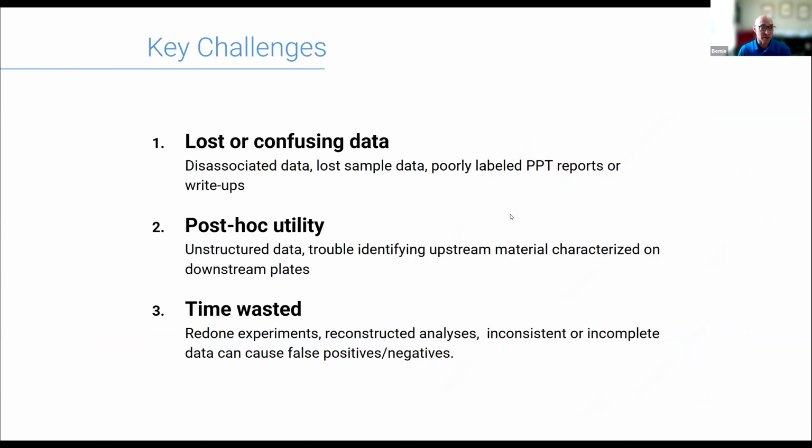So there's definitely some serious challenges for biotechs designing enzymes, designing or discovering antibodies and building them out. A select few presented here are things like lost or confusing data, people losing track of samples, losing data itself, or an inability to make use of data after the fact because it's stored in a PowerPoint presentation or in some standalone ELN, or in somebody's file system somewhere with a strange label that nobody knows how to interpret besides the scientists that put it there in the first place.